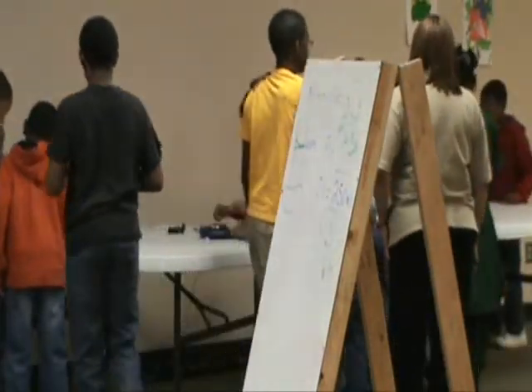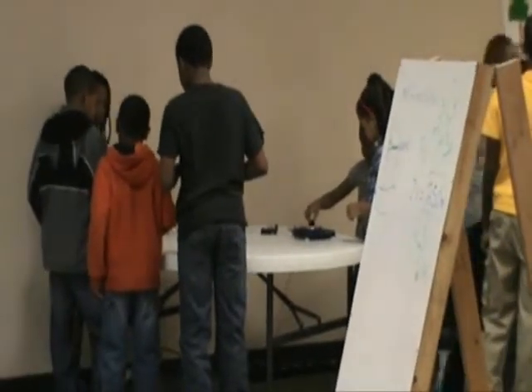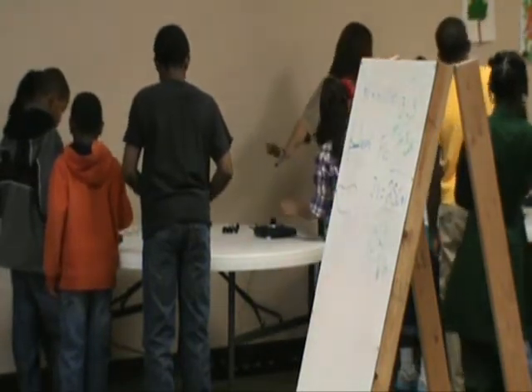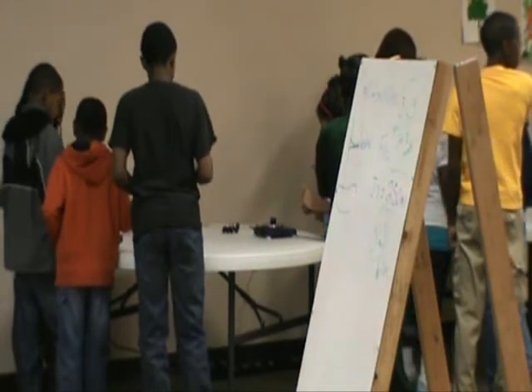Okay. Now, before you weigh, you have to zero your balance. Make sure you zero it. Make sure the sign is zero. Wait a minute. Be patient. Don't raise it up. Wait. Okay, go ahead and take it off now.